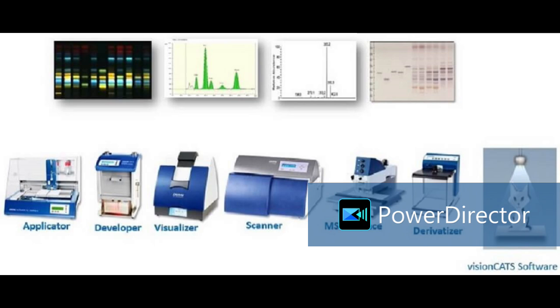Some of them have also gone for training. How will that be useful for fats, like ghee, to know what adulterant is present? Ma'am, we will come to that part. We have all those slides. We did that analysis already, and we have an installation in the Central Agmark Lab in Nagpur.